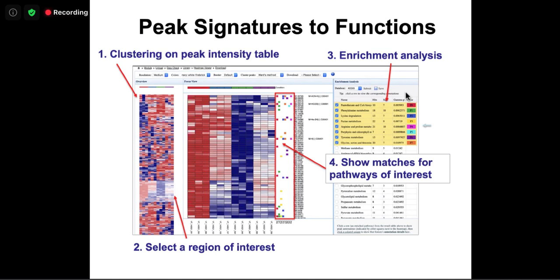The other thing is that we don't want to do a global t-test and rank them. We just want to see what the patterns are within my data. For example, I think this is an immune cell, probably a dendritic cell, treated with different antigens, maybe. I forgot the whole context. It caused different changes.